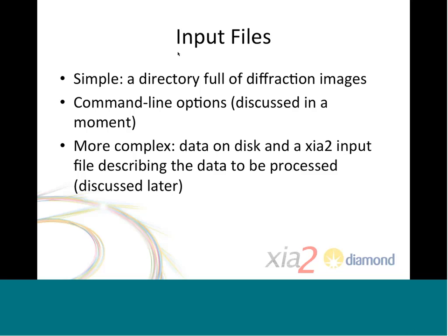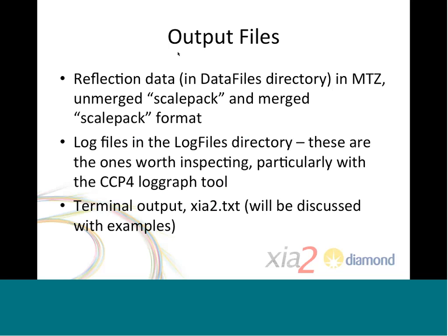There are also options to have the data scattered around the disk and provide an XIA2 input file, which describes in a bit more detail what the data are, where they are, and how you want them to be processed. I'm going to cover all of these things, but I would always suggest that you start with a simple way of running.